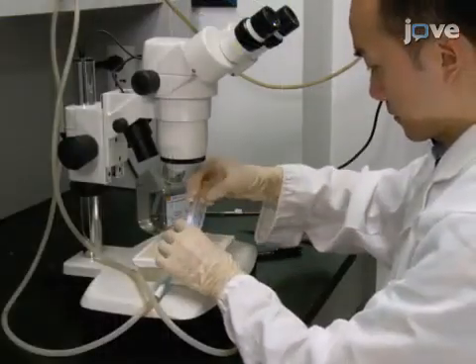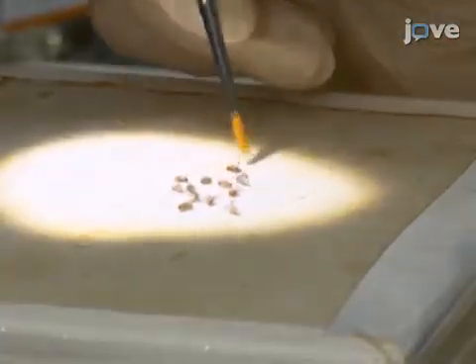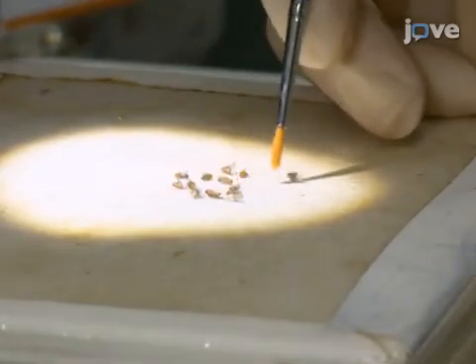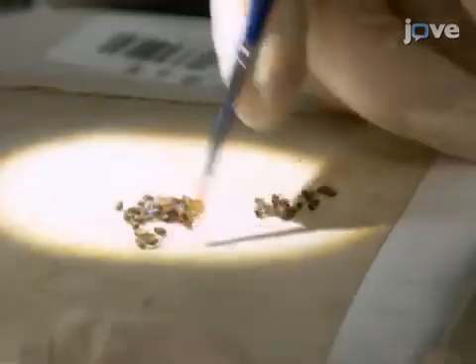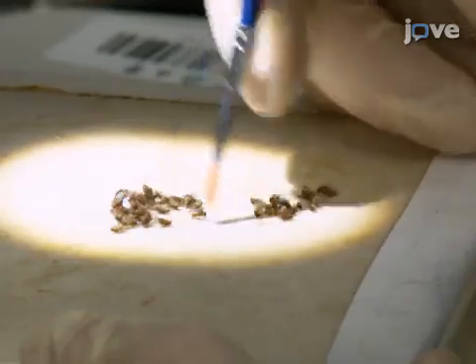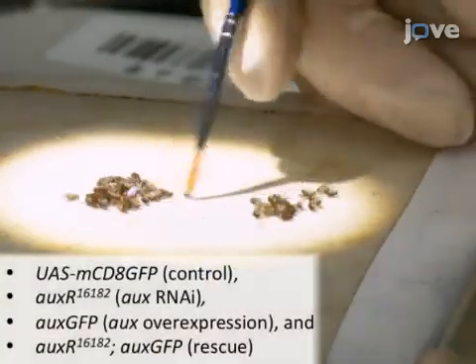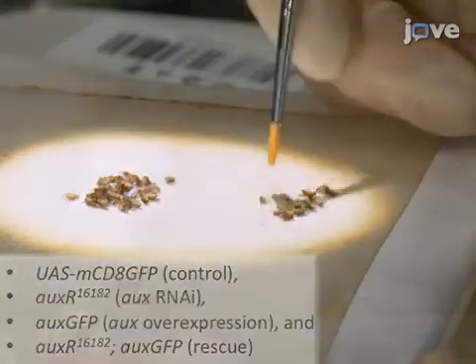Collect UAS Dicer 2 DDC-GAL4 fly virgins under carbon dioxide anesthesia. Cross the virgins to two-day-old adult male flies carrying the following genotypes with a male-to-female ratio of 1 to 2.